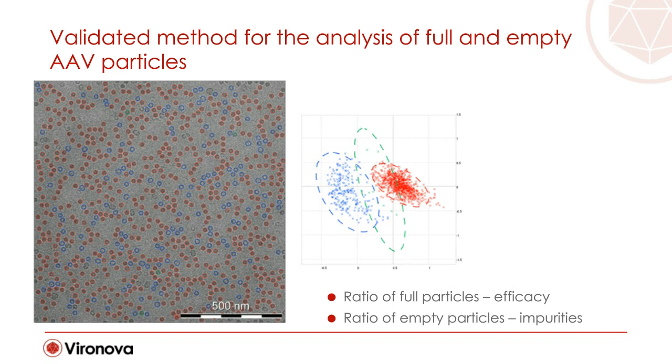Okay, next question. Can you use a particle standard with known concentration for viral particle quantification? Yes, you can. Of course you can. It's a method that I would use very carefully, though.